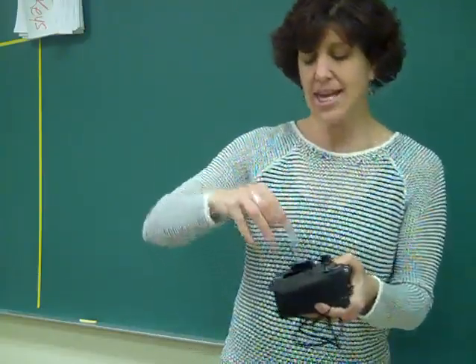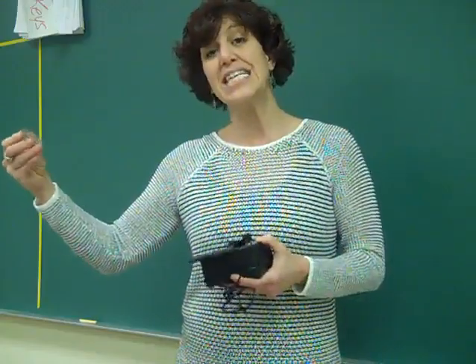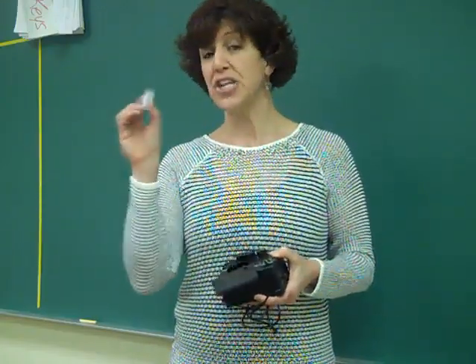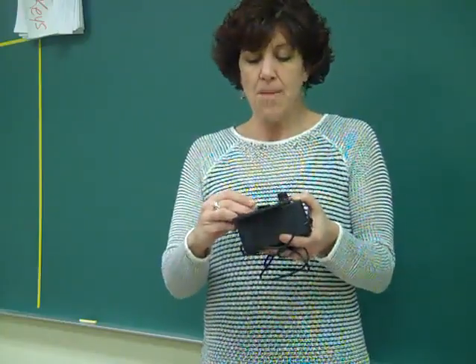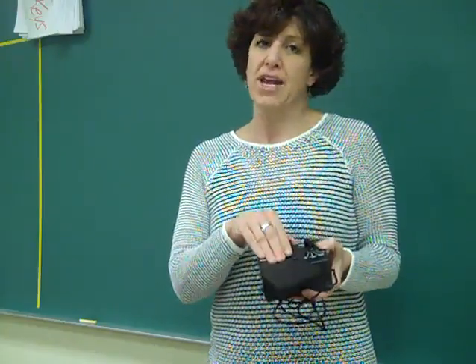If I keep this under a bright light, this should start doing photosynthesis. The more photosynthesis it does, the more DPIP it will reduce, changing this from blue to colorless. So if we keep measuring either transmittance or absorbance, whichever one you choose, really both of them are going to show your photosynthetic rate. One is just going to go up and one is going to go down. You will keep measuring that value until you can plot it on a graph and get a rate of photosynthesis.